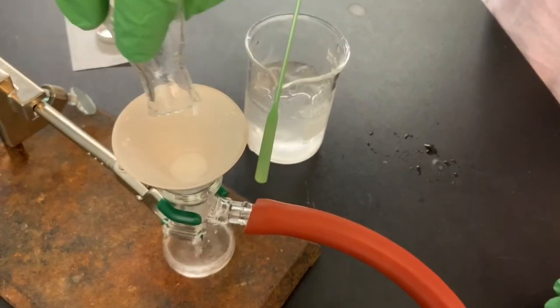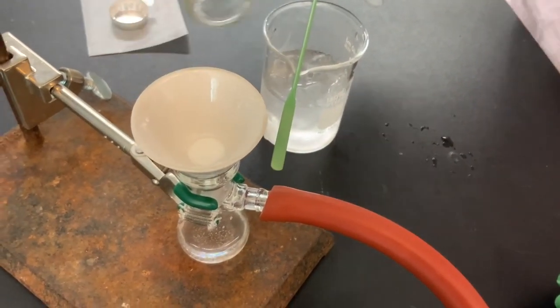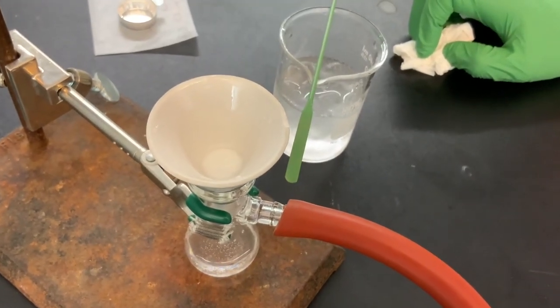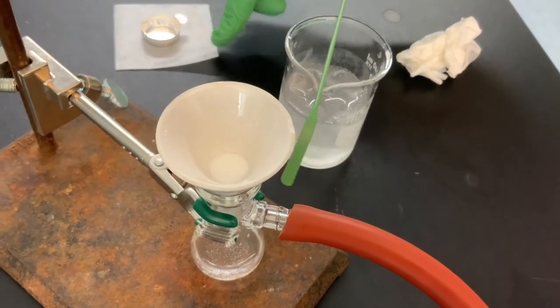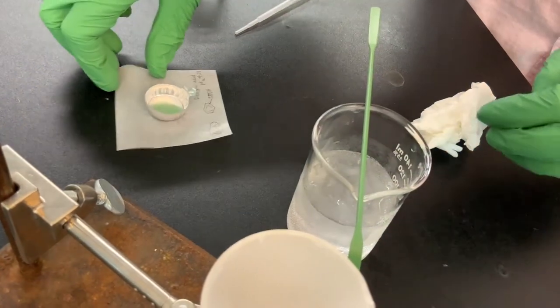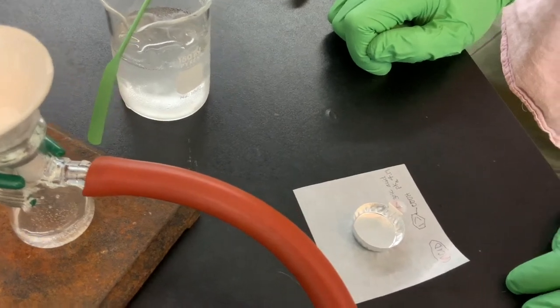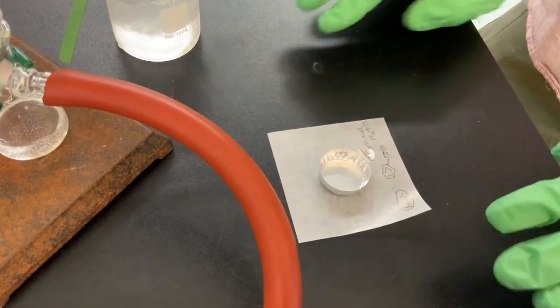So what we've done there is we've tried to get a really good quantitative transfer, and we've also washed our benzoic acid from any excess HCl. We're gonna let the vacuum pass over the benzoic acid to dry it, and then eventually we're going to scrape the benzoic acid out of the Hirsch filter and into the aluminum weighing dish that we had tared earlier. And so now it's time to move on to isolate our neutral 9-fluorenone, which has always remained in the organic.